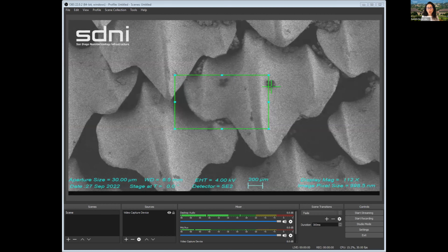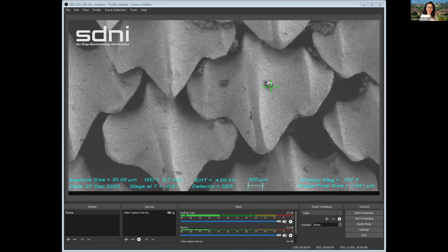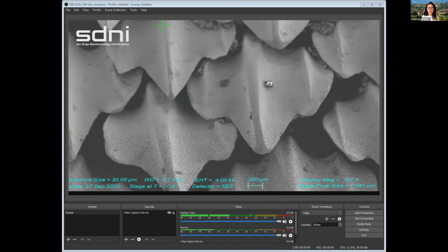And teachers, I'm sure we're all thinking structure and function as cross-cutting concepts, right? NGSS stuff in terms of all these different types of materials that we're looking at that are in nature and have these very specific structures that are tied deeply into their functions. So this is just an example of how you can connect some really cool technology with some concepts that you're probably teaching in your classes.